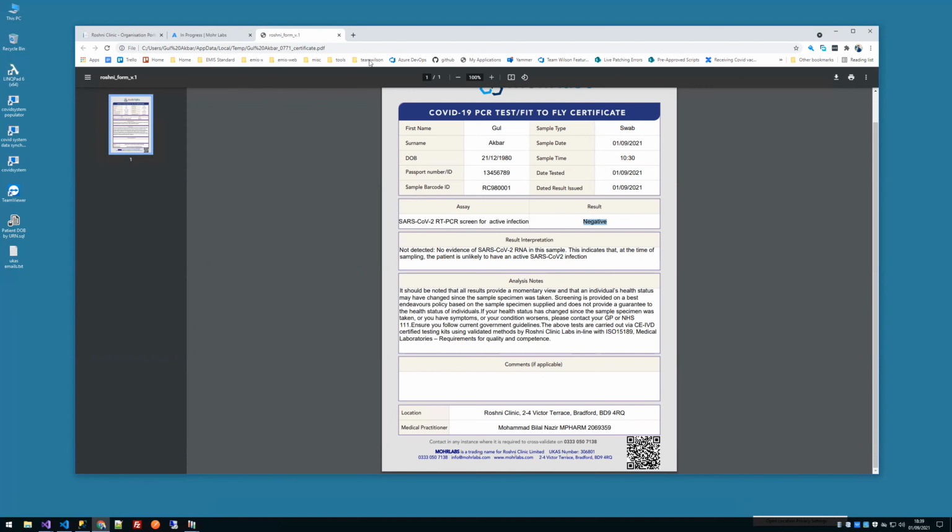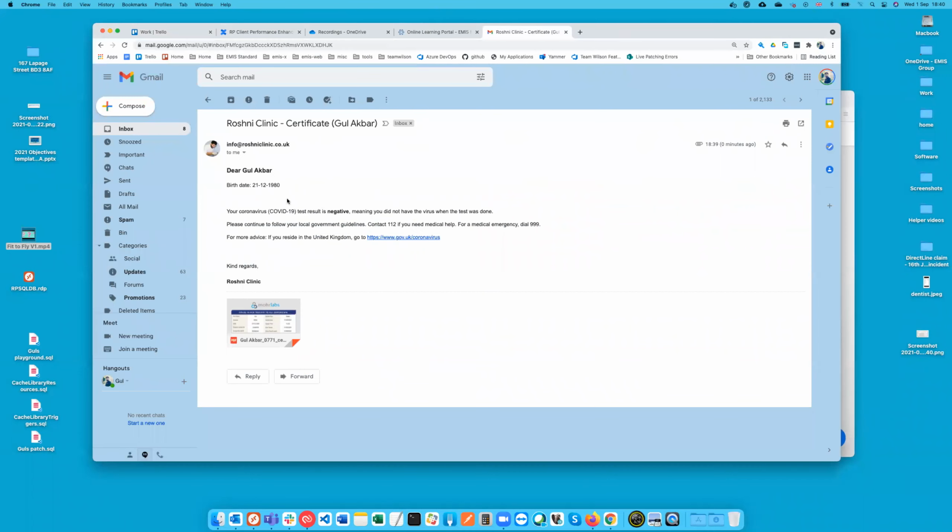So what I've done there is effectively completed that. It's all done. It's opened the certificate for me. It's sent an email out to both, and I can quickly show you the certificate that was sent to me, which is here. Oh yes, put this in here. It's a good idea. So here's a certificate.